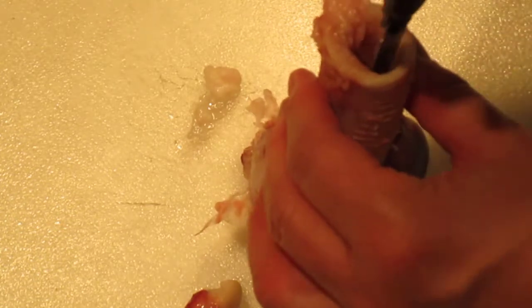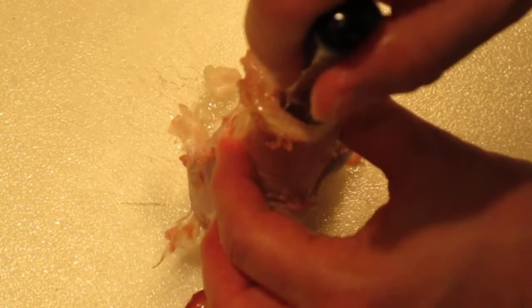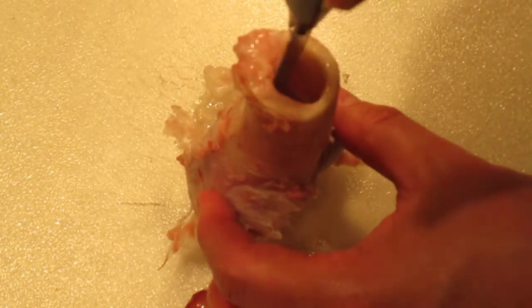I can feel the knife hitting down there and getting some resistance — that's the spongy bone. You can kind of hear it crunching a little bit.